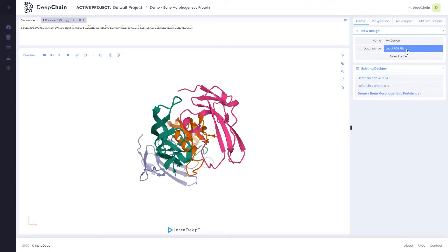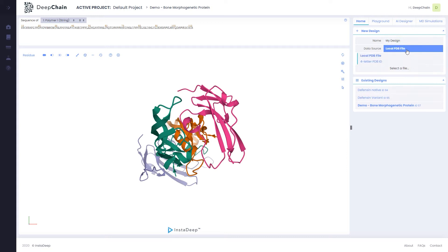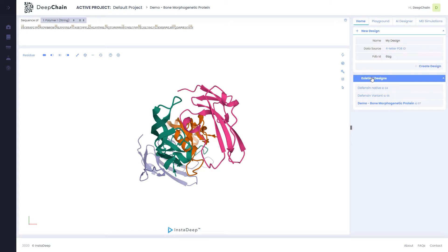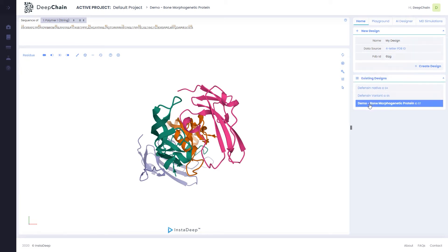A new design can be created by either uploading a local PDB file or downloading one from the RCSB PDB database using a four-letter code. Once your design has been created, you can select it from the existing designs panel.